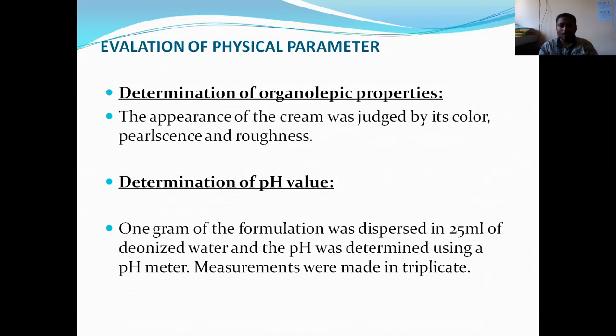Next is the determination of pH. With the help of a pH meter or pH paper, we can determine the pH value.